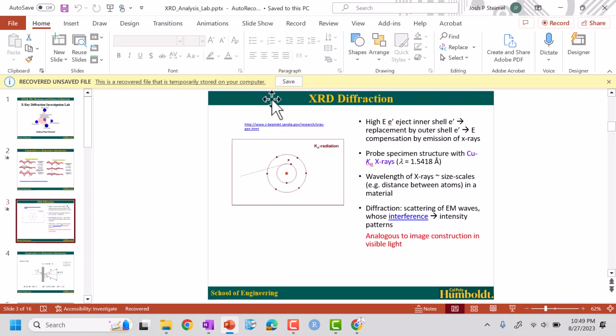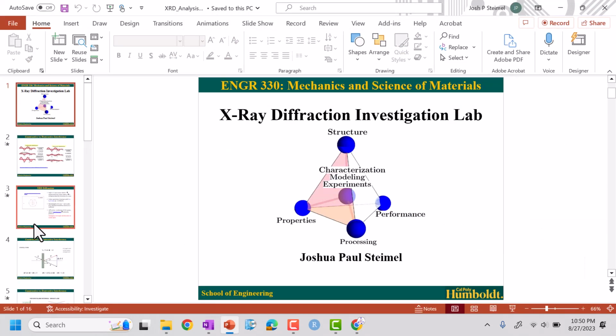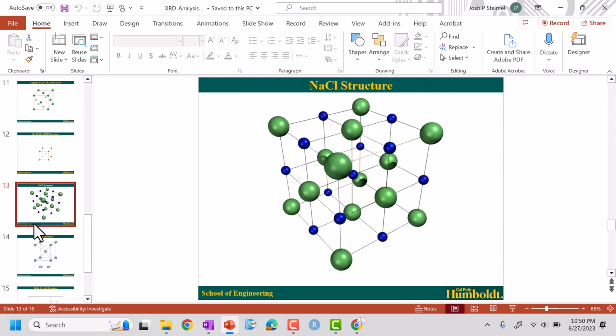Let's go back. So if we look at, for example, NaCl right here, and again, we know the big structures and little structures there, you could do a very complicated method, which is taking the 2 FCC lattices and then summing them together, because effectively that's what we're doing here. But you can also notice that we can do a little trick.